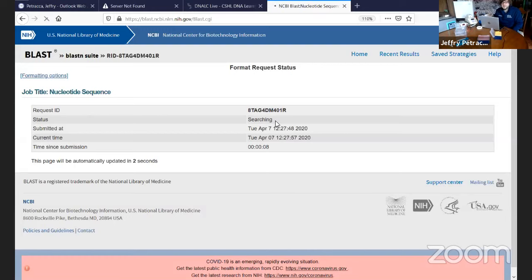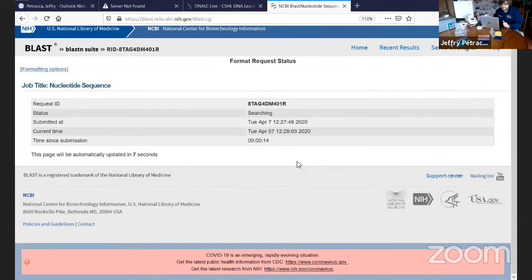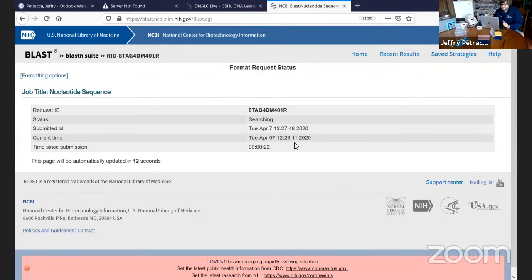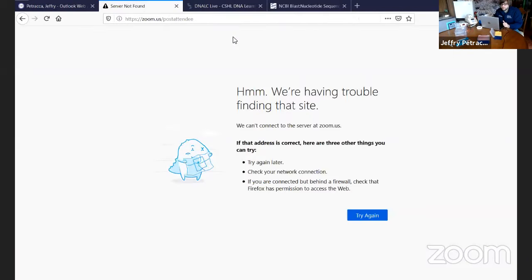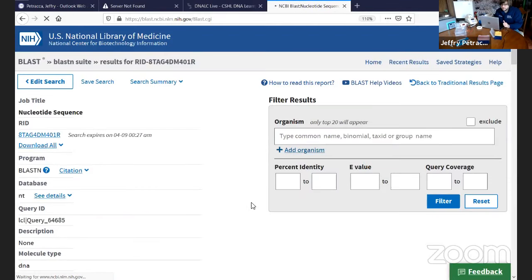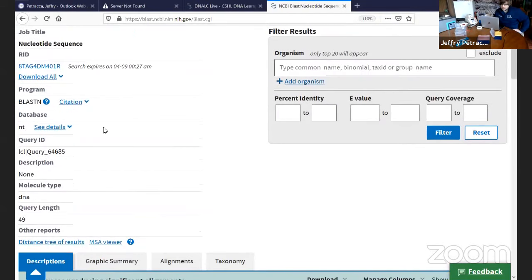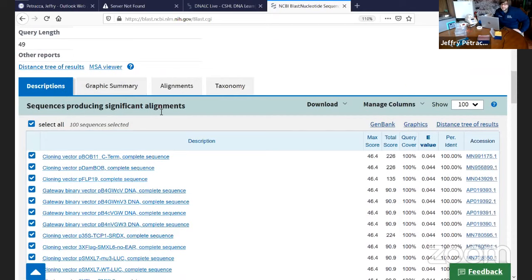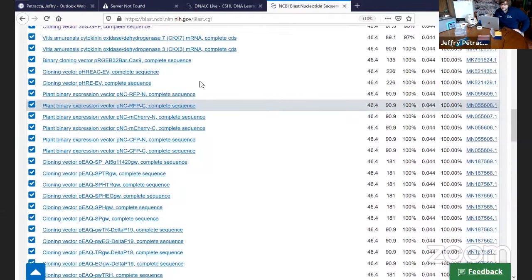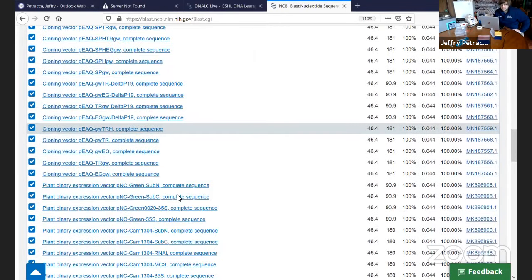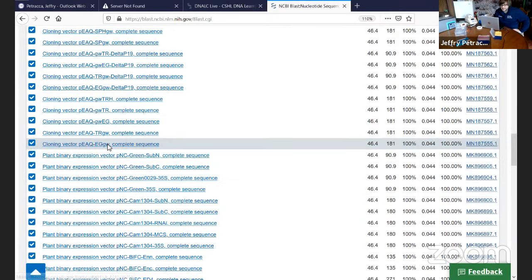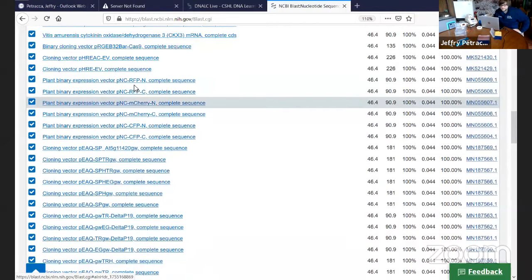Once I have my query entered, I'm going to hit BLAST. What's going to happen is your query will be compared to all of the different sequences in GenBank's database by what's called an alignment — basically trying to match up the base pairs. Here are our results — sequences that produce significant alignments. There's a lot of information here, but I notice a common theme: I see the word '35S' intercalated into the results. Basically, each one of these represents different sequences that have been published to GenBank.